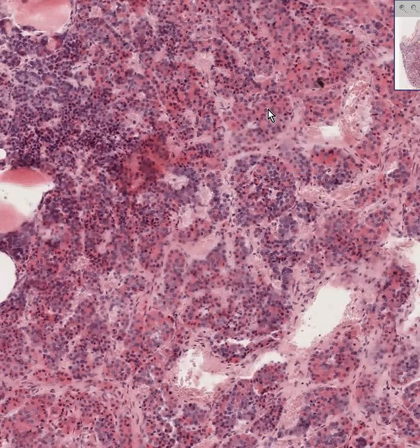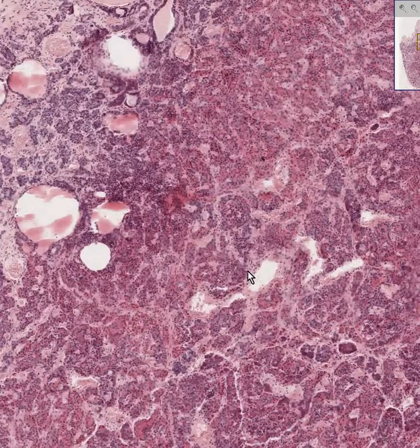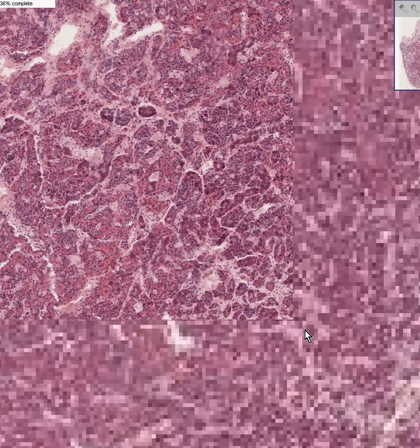So in other words, the basophils, which are these blue cells along here, and maybe we could get better views of some basophils. Maybe let's go a little bit deeper. We'll find a better differentiation between acidophils and basophils.